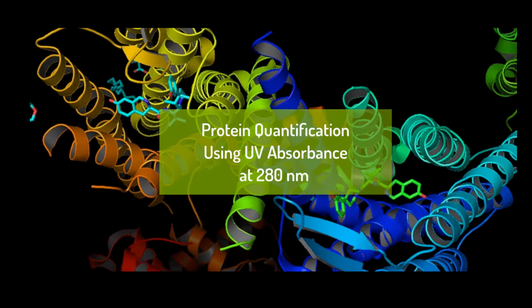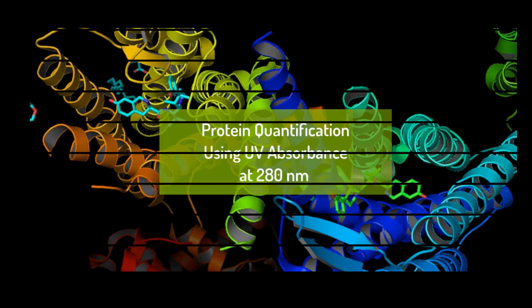In this video, I will teach you how to quantify protein samples using absorbance at 280 nanometers as measured by UV-vis spectroscopy.